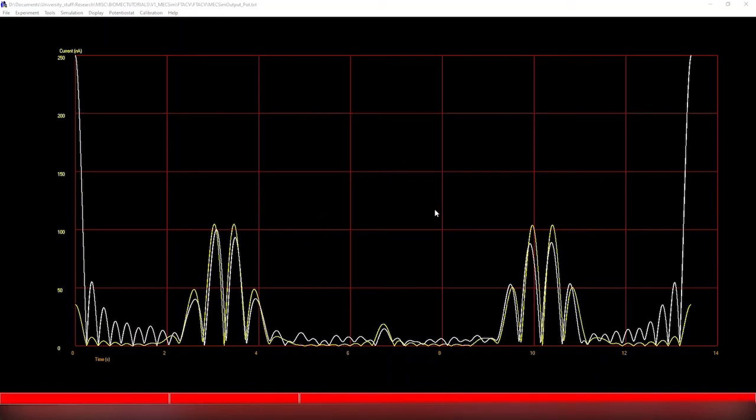So here we can see with the change of resistance and K0, we have a slightly better fit in the forward process, a better fit, but still not the best in the backwards process. Now we could sit here and change the resistance and K0, we could change them up and down. The diffusion as well could be something we could fiddle around with within reason. We could change a lot of parameters. For an E mechanism, around 6 or 5, very easily do that. The formal potential is also a bit wrong in this system. We can fix that. But we could sit here for ages and do this, and then we'd have to go up into the higher harmonics and do it for all those as well.